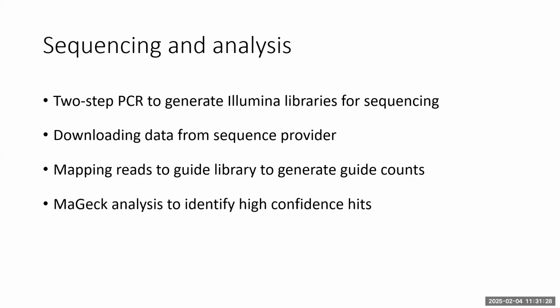We do the further analysis using the guide counts using MAGeCK, which is the Broad tool that they developed. It's online, available on Galaxy, and is relatively easy. Pretty much anyone can do this step. Previous steps can get a little bit tricky, and certainly we had the help from Nick Parkinson who did this informatics aspect.